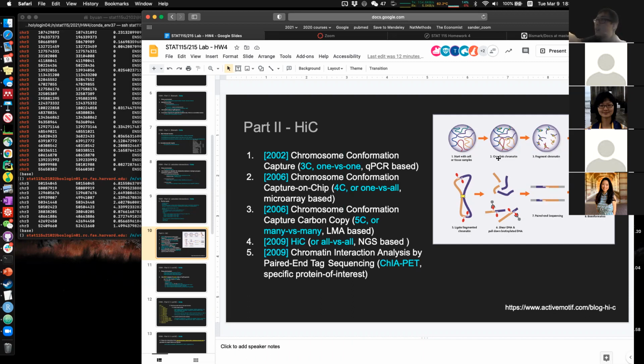And then you can imagine the reads we have now would include two parts, one from gene A and one from gene B, and they are cross-linked with each other. So now what should we do with this kind of data if we want to reconstruct their original structure?